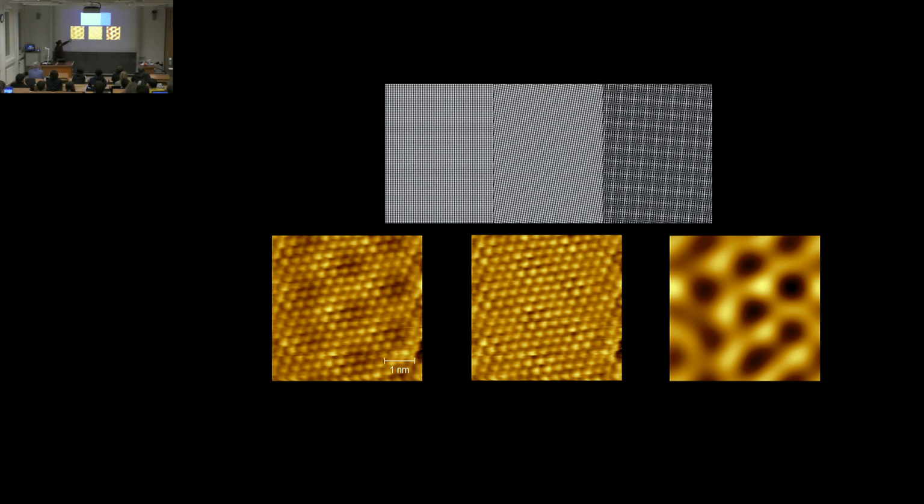And so this picture is what we can see with a moire between gold and VSe2. And these two pictures here are just Fourier transforms, so we just treat this image to highlight the structure of the VSe2, or here the superstructure, so you really see the shape of the moire.